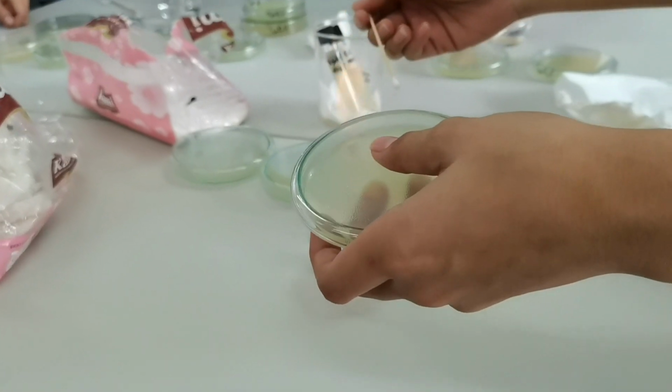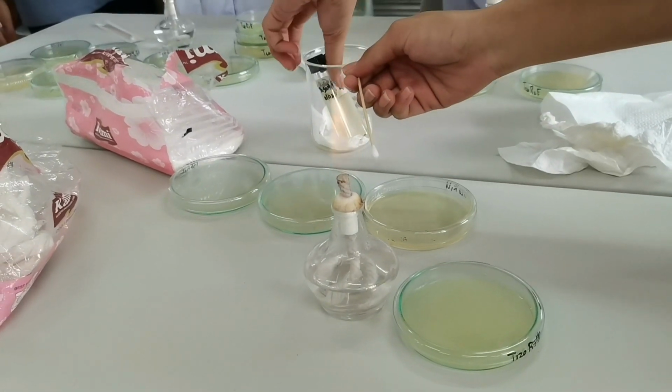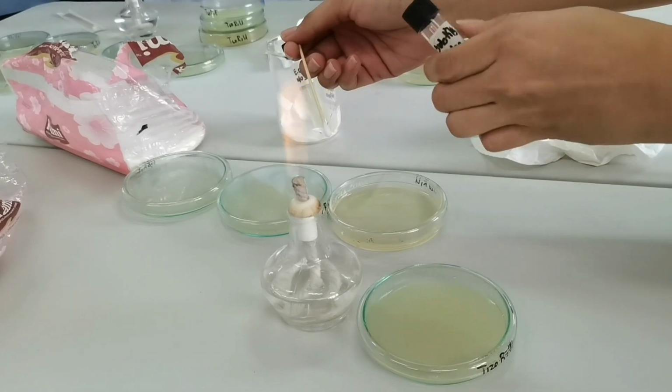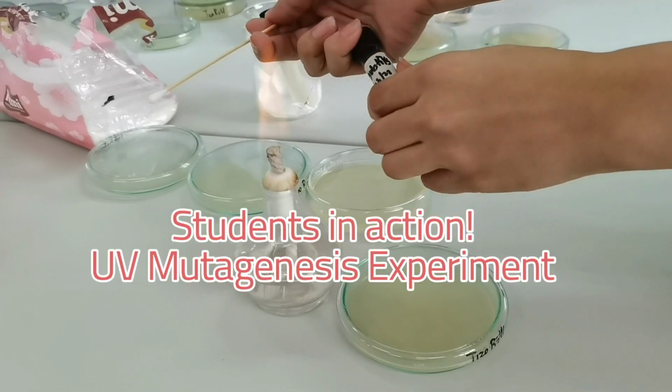Hi there, it's a beautiful morning in class today. This is an experiment that we're doing, and it is called UV mutagenesis.